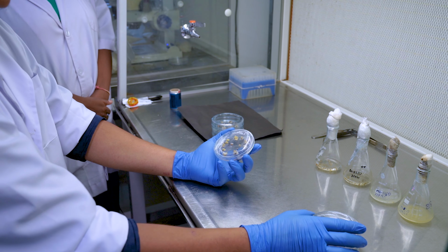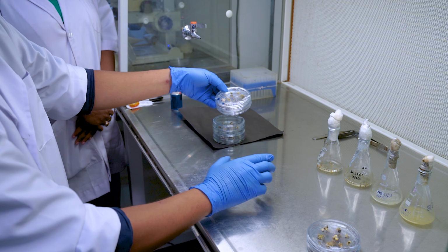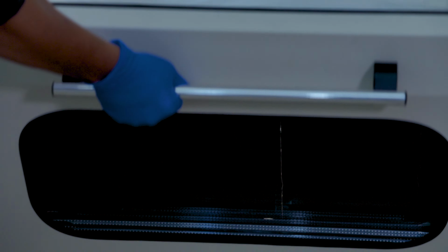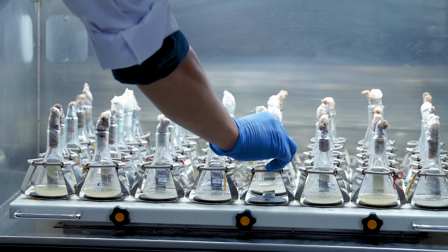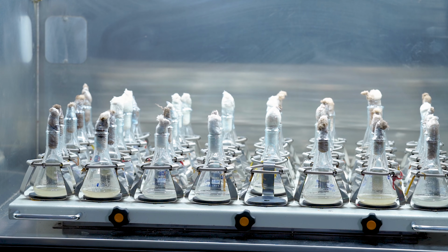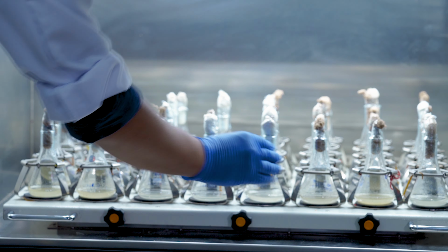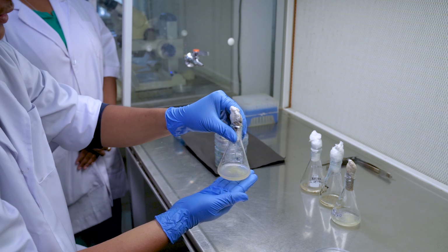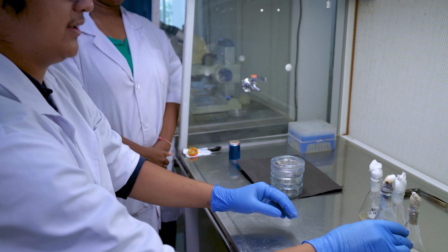The embryogenic calli will be pale yellowish in color, and with these embryogenic calli we are going to initiate the ECS, which we can see over here. These embryogenic calli are inoculated in liquid medium, which is modified MS medium, and maintained in the dark in an environmental shaker at 26 degrees centigrade. It took almost 3 to 4 months to establish the embryogenic cell suspension. The fine cells that we see here are the embryogenic calli which we have cultured in the liquid media.